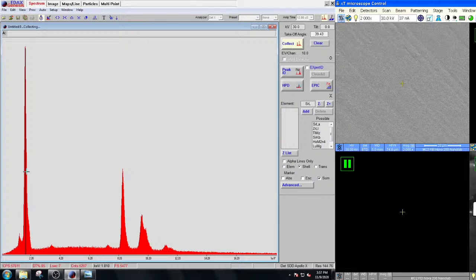So this peak is showing up as strontium or silicon maybe. To be honest, I don't know if I even trust any of this because this dead time is so high. Let's get the dead time lower, and then we'll see if this shows any better.